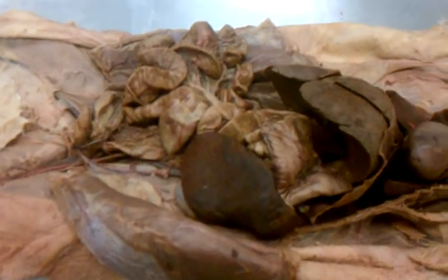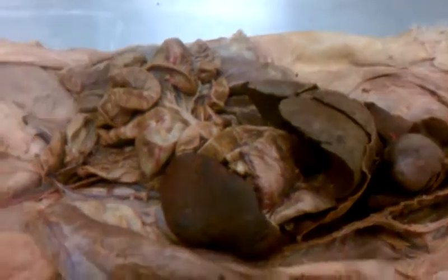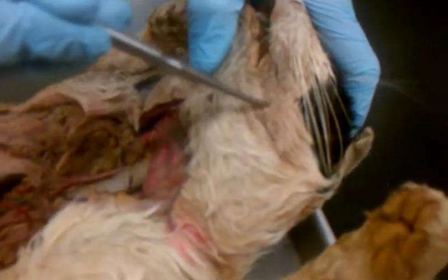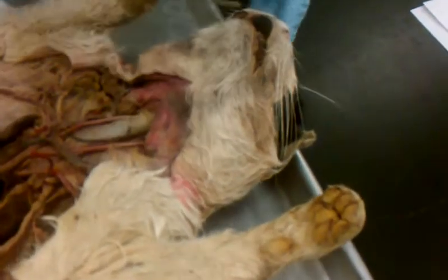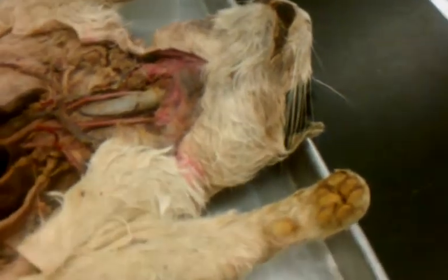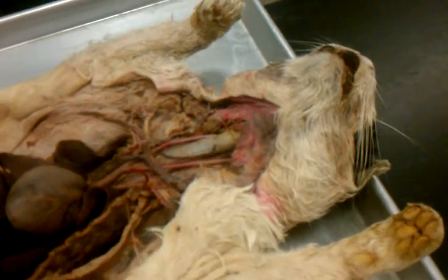Okay, so it starts with the digestive glands. Start with the salivary glands. Where do you think those are? No. In your mouth. So they're outside the jaw. So salivary glands are back here. Say back the jaw? Or just like near the jaw? They're outside the jaw. They're back here. Like when you eat something sour, you can feel the salivary glands.